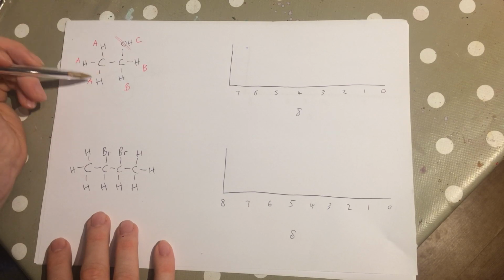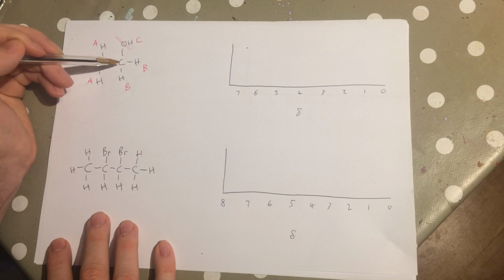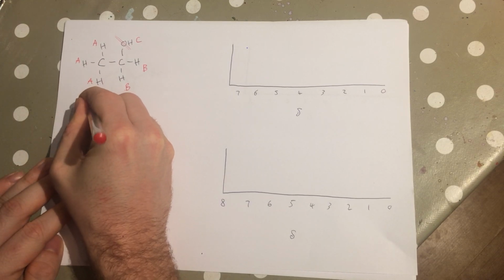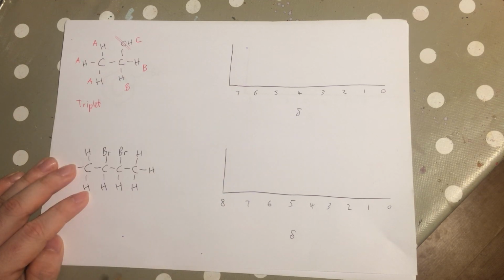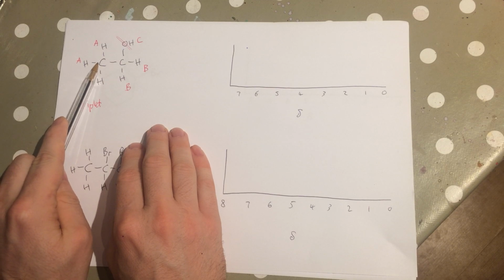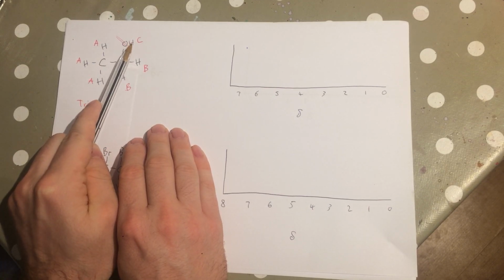So in terms of the splitting we'd have here, my environment A has two adjacent hydrogens, so that would be split into a triplet. My environment B, well, you might say it's got three adjacent hydrogens that side and one adjacent on the OH. But remember, OHs and NHs do not cause splitting.